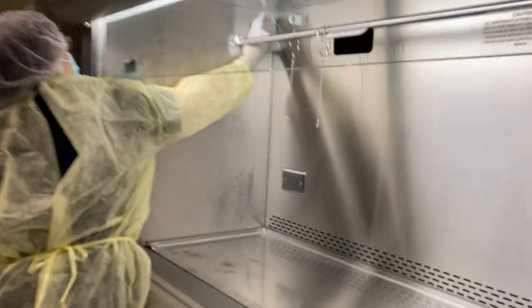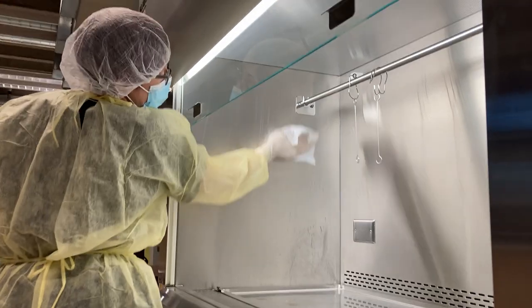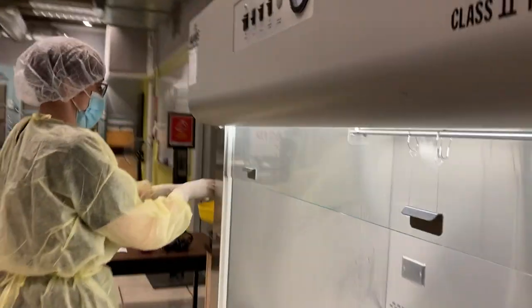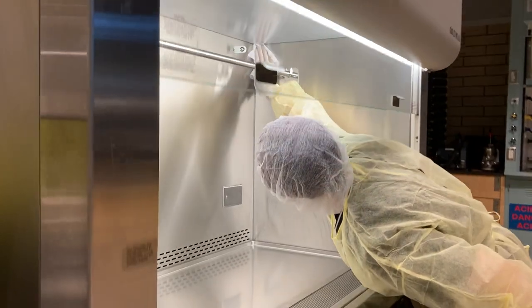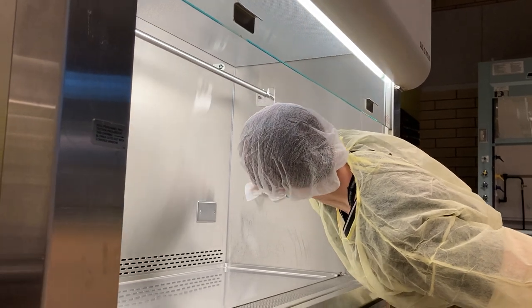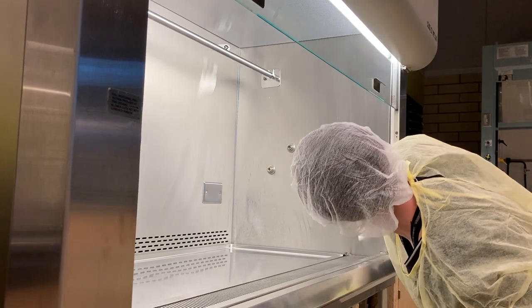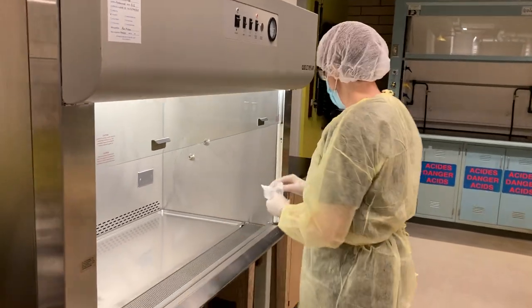So you start at the back and go top to bottom, and then bring your cloth back up. Again, slightly overlapping. We're going to repeat this step with the other sidewall. Again, top to bottom with slightly overlapping strokes. The sidewalls are the only surface that you would do method B.